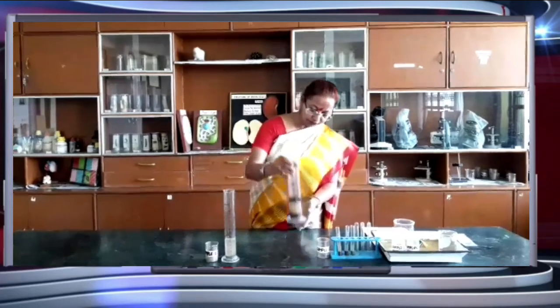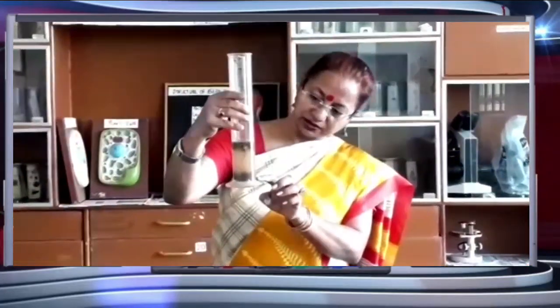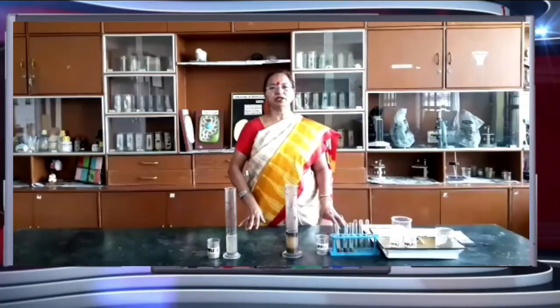And this is sample 2, with a very clearly visible thick layer of humus, which is alluvial soil and very good for growing crops, and even at the bottom you can see different particles according to size. So this is how we can check the texture of the soil and pH of the soil.